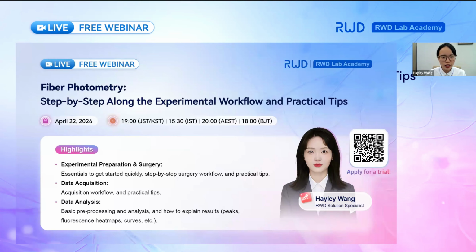So the topic of today's webinar is fiber photometry step-by-step along the experimental workflow and practice tips. In this webinar, we will focus on experimental preparation and surgery, data acquisition, and data analysis.